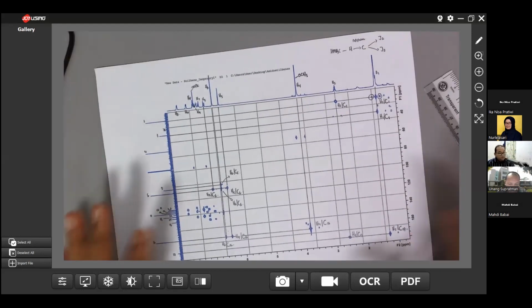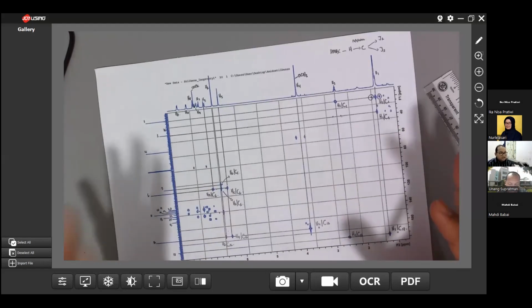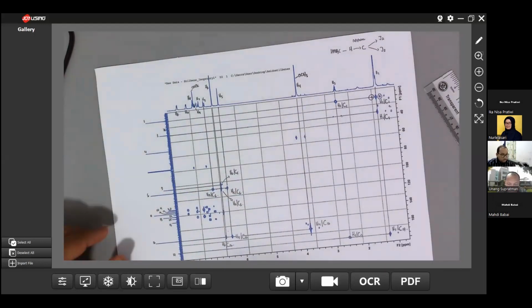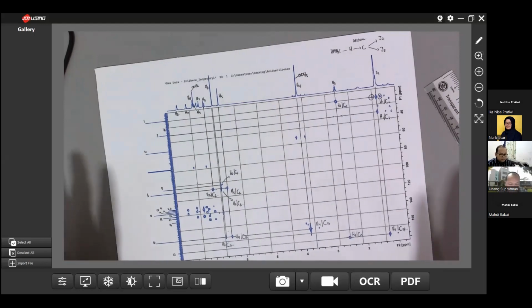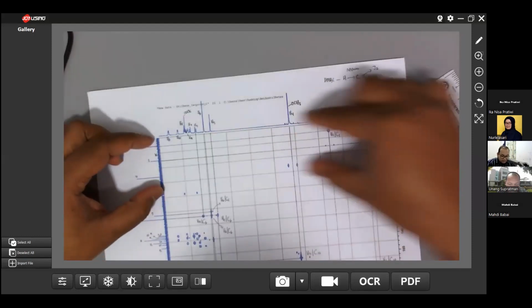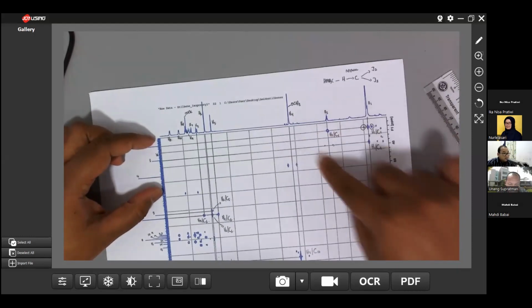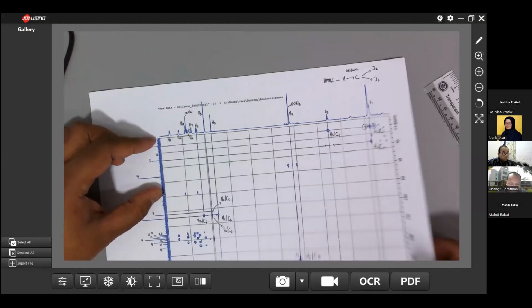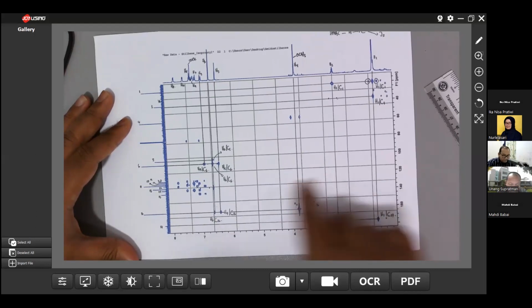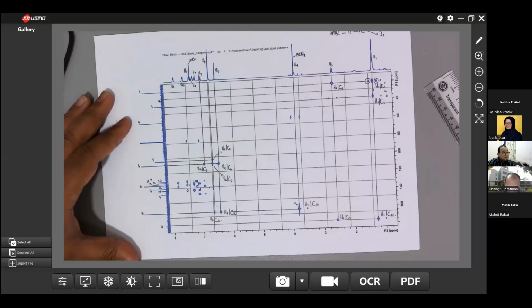If you get a very messy spectrum, what you have to do is find the good area to solve. The good area where you can make some connections is in this area. This area is not messy, and also this area is not messy. Sometimes maybe this can be considered also.